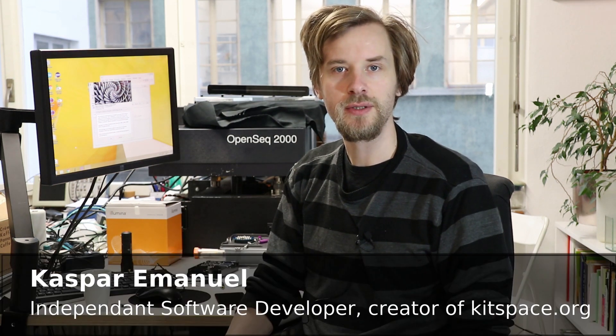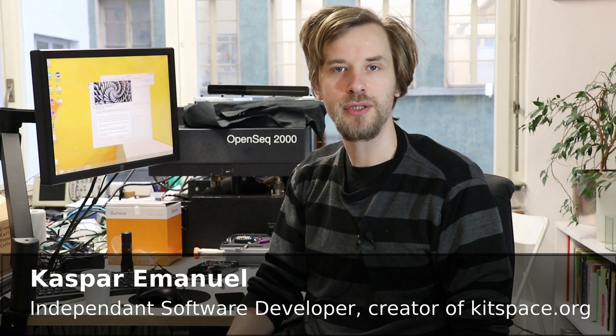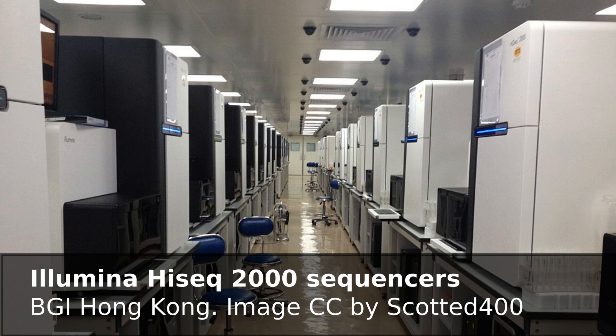The Illumina HiSeq 2000 and 2500 are advanced DNA sequencing machines that have been replaced by a new generation. Institutes and companies around the world are now getting rid of these machines and they're available for cheap.